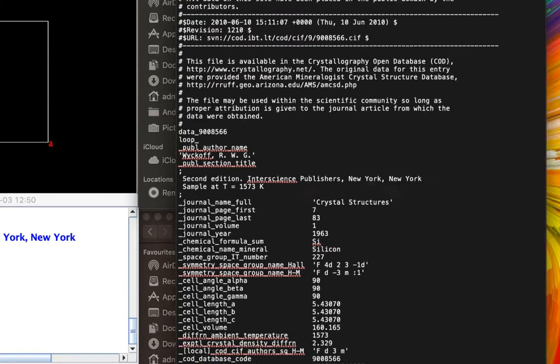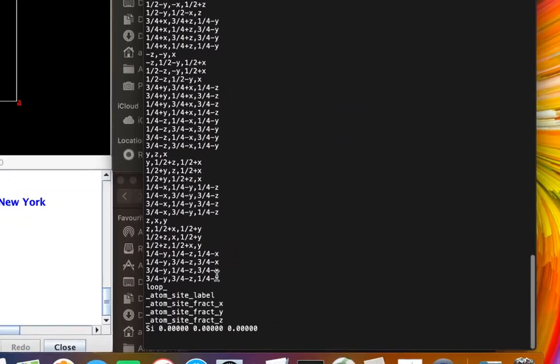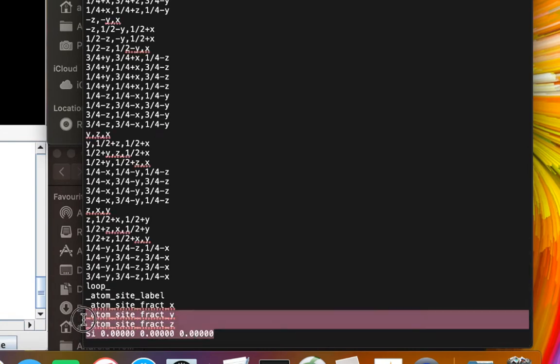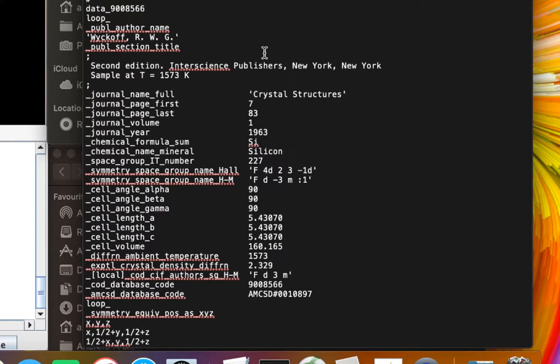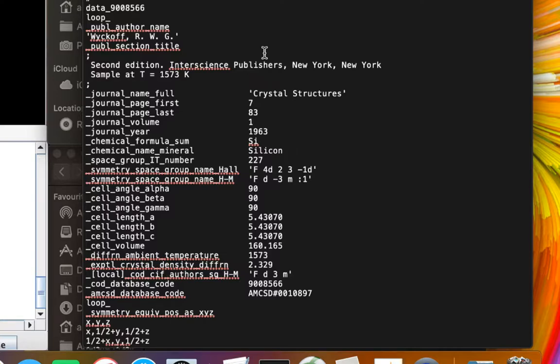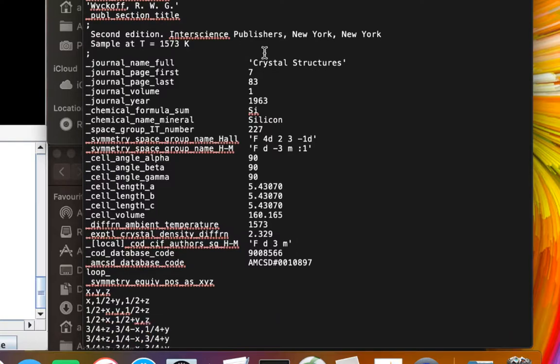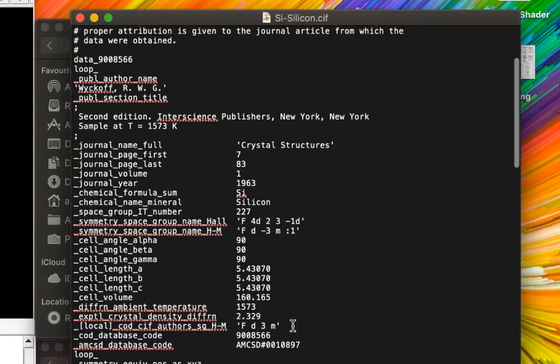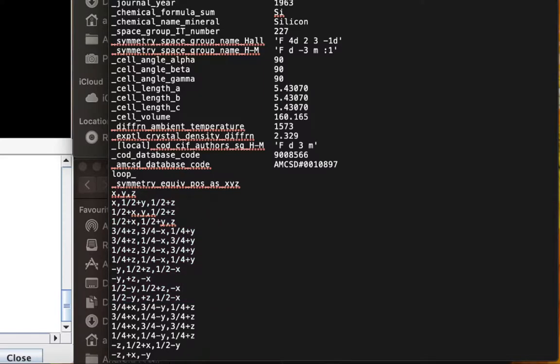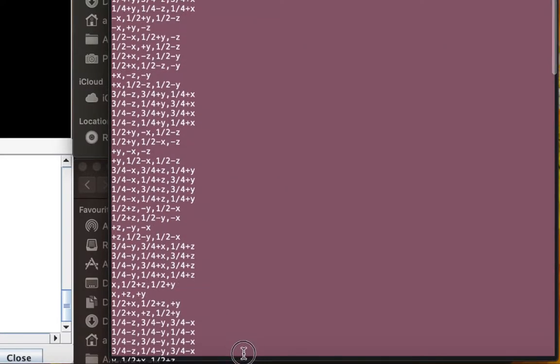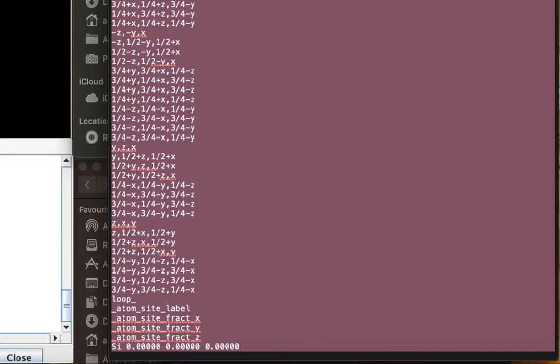If you right-click on the .cif file and open it with a text editor, you'll notice it only contains the atomic position for a single atom — at the origin. So here is the atomic position for Si at the origin. You might wonder how other software is able to visualize all the different atoms from this .cif file. That is explained in one of my previous videos: what these programs do is read the space group and then use that information to generate atoms at all the non-equivalent positions using the symmetry operations associated with the space group.